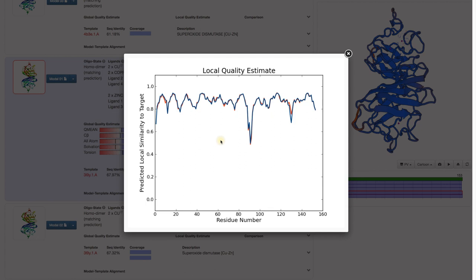The plot gives a quick overview. As a rule of thumb, stretches below 0.6 hint towards regions with low quality.